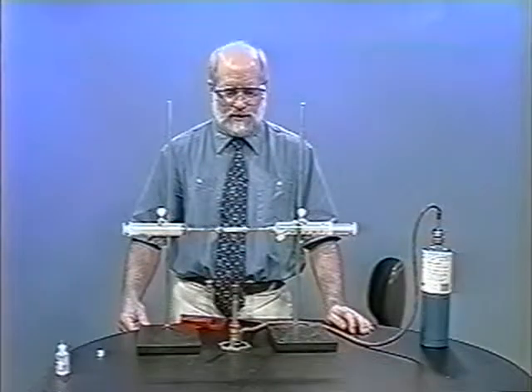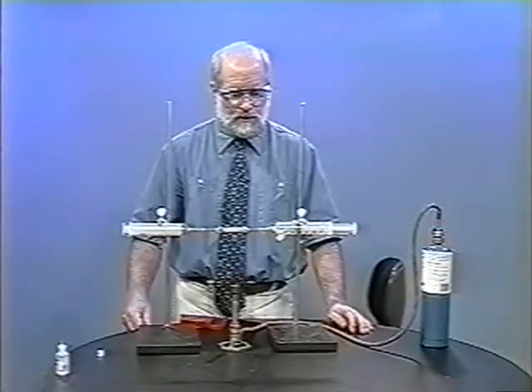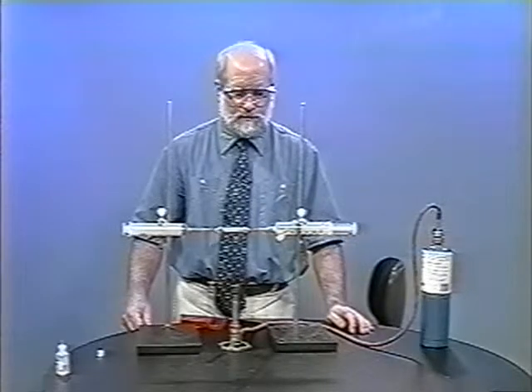In the final technique that I'd like to demonstrate, we're going to catalytically oxidize methane.